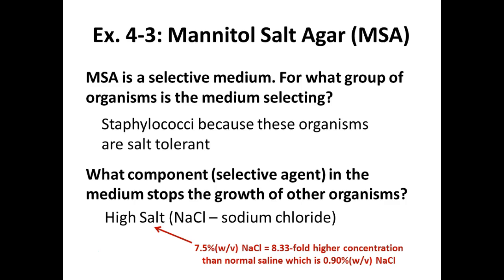But again, we have other organisms in this lab, so that does not ensure that you have a Staphylococci if you have growth. So most of you guys will notice, though, no growth on these plates, right? And when you look for your organism, only a few of you guys will actually have growth. All the rest were killed by that high salt concentration.